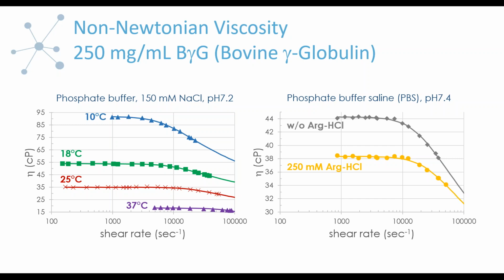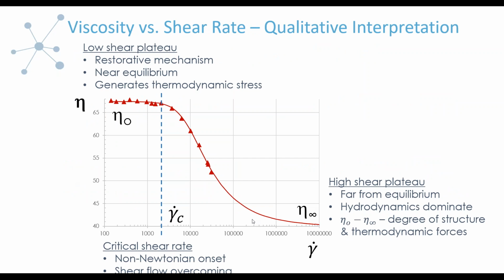So here's the data that we have, and now we want to identify how we are going to scale this data to answer some of the questions I posed about why these changes are occurring, and whether we can pinpoint in more detail what's happening. So to start, we're going to first have a quick discussion to identify how we're going to scale the viscosity axis.